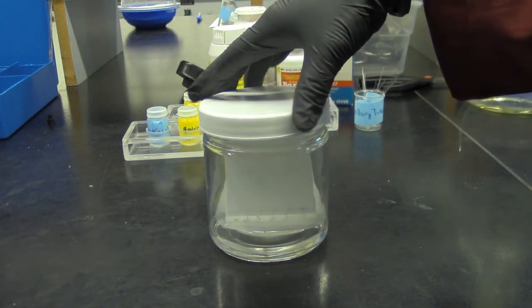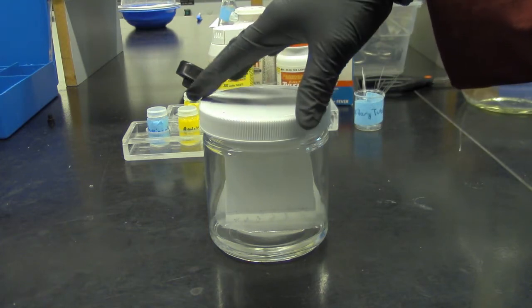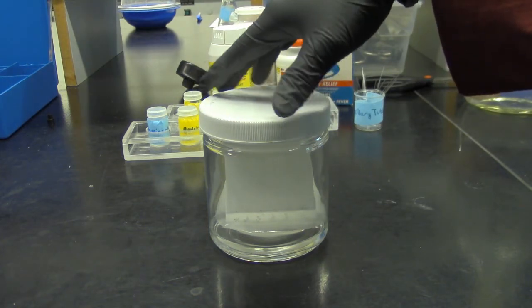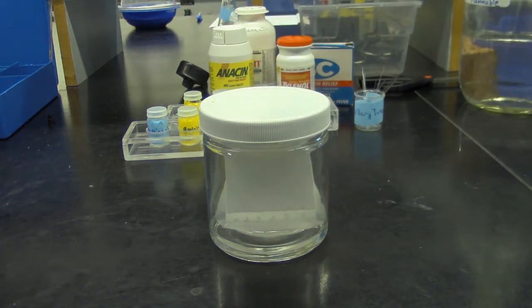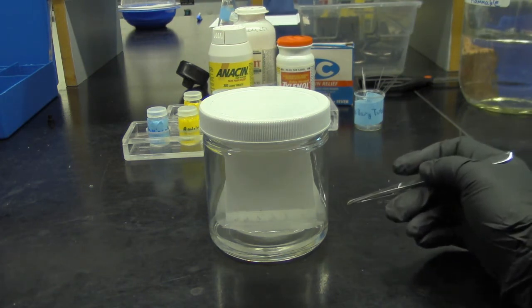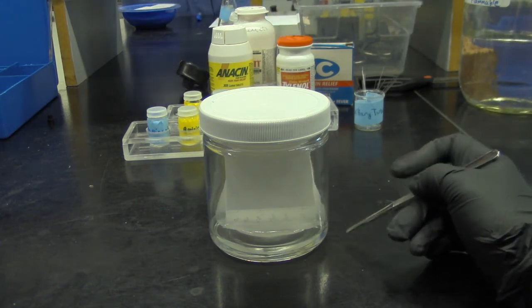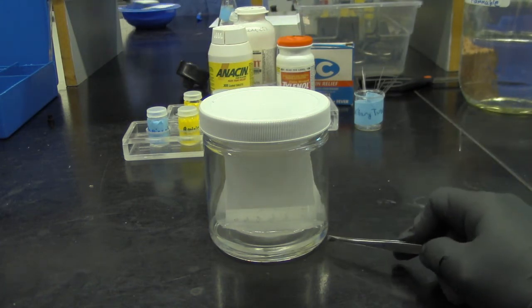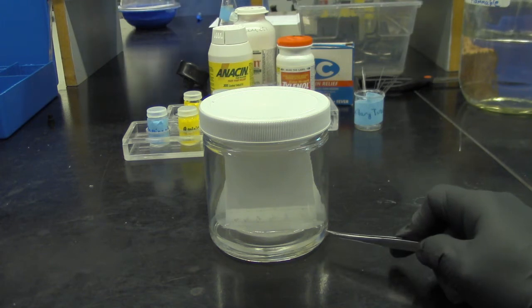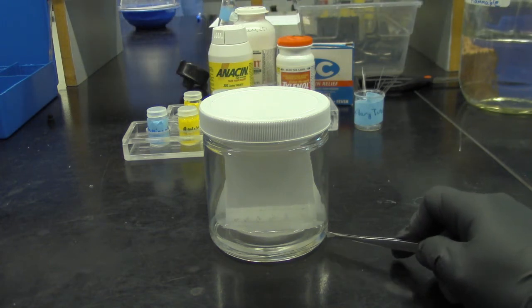And from here, I want to make sure that it doesn't move, so you shouldn't move the chamber. Okay, you can see the capillary action rising, right? You see the mobile phase, which is the solvent, ethyl acetate with 0.5% glacial acetic acid. That is the mobile phase.